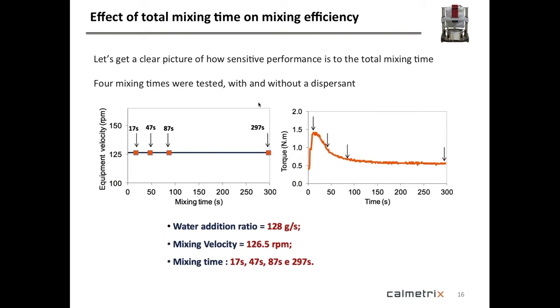You would define a stable suspension when you look at this curve here, when this curve levels off at some point. Eyeballing it is very often difficult when you try to find the exact point, but you would look at the first derivative, and that would give you an indication of where that point is, when it reaches what we call the point of fluidity.